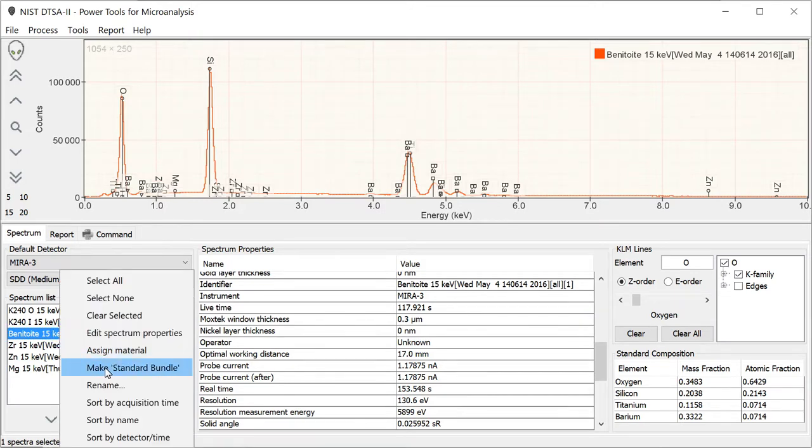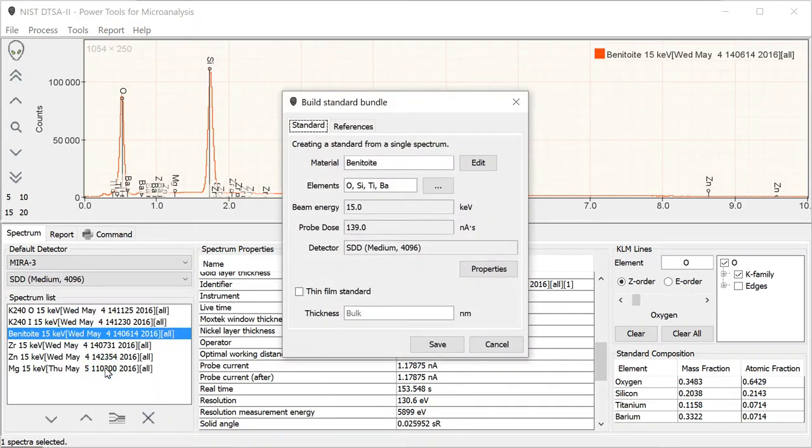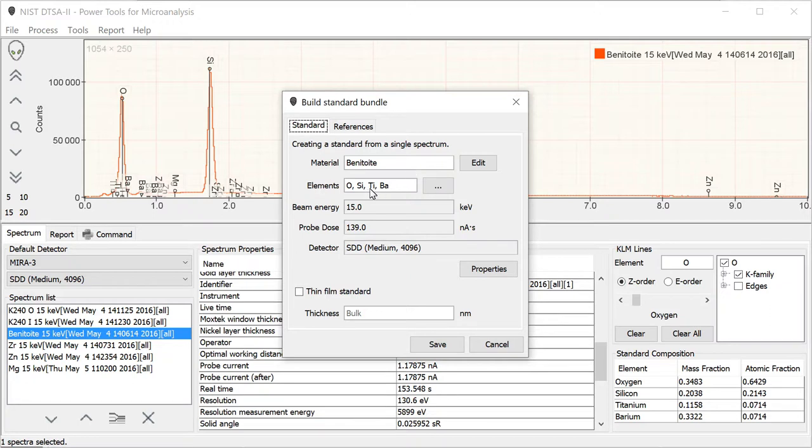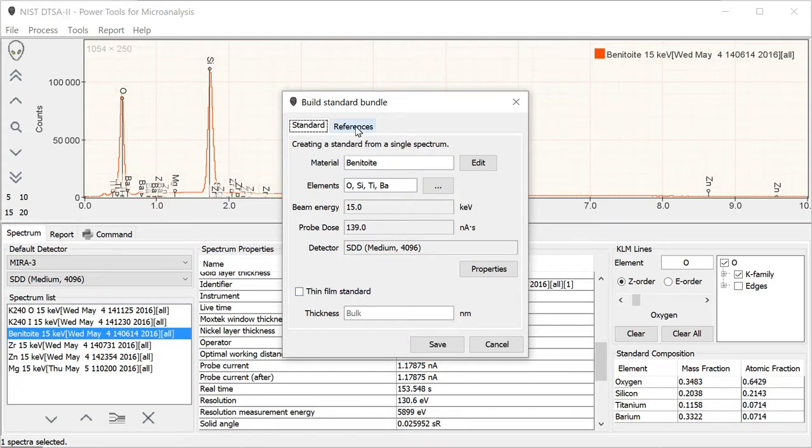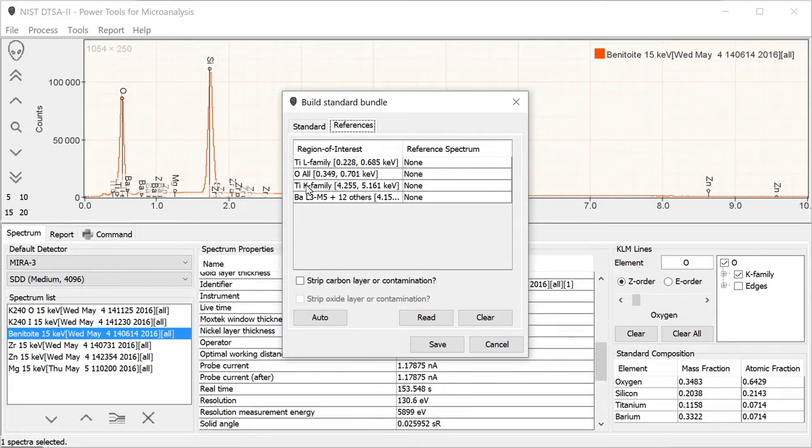A standard bundle: you select a spectrum, or if you have multiple spectra from the same material, you can multiply select all those spectra and sum them up to make a single bundle. But we'll just do this with one today. So we'll make a standard bundle. We've already assigned the material for this, so it knows that it's Benitoite. We know that it has these elements in it. We know that the probe dose was this and that the beam energy was this. However, when we go over here, we notice that there were those interferences which were going to require references.